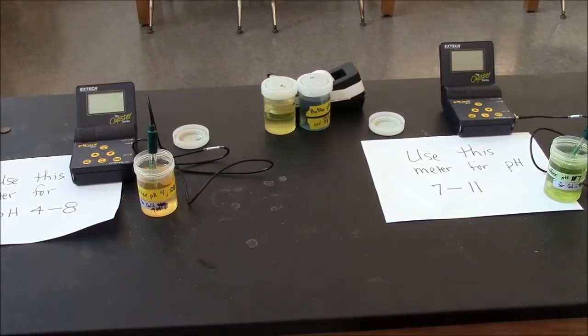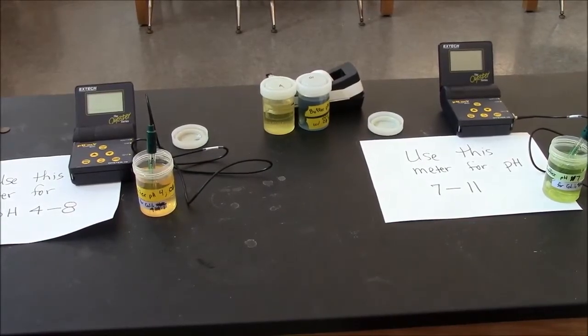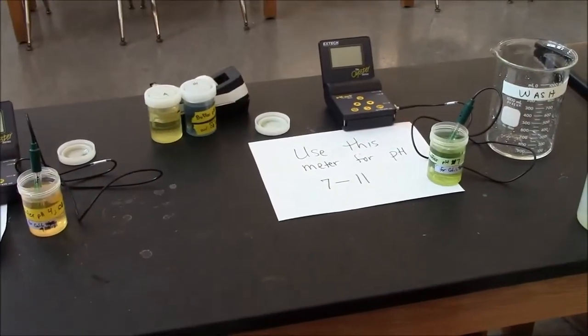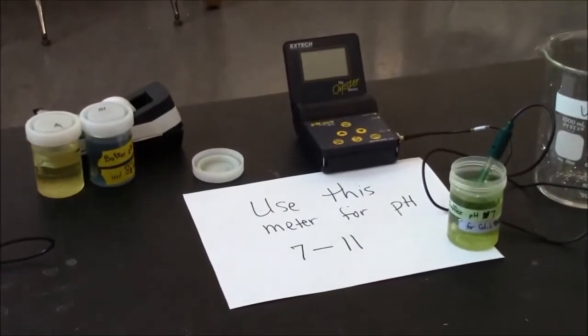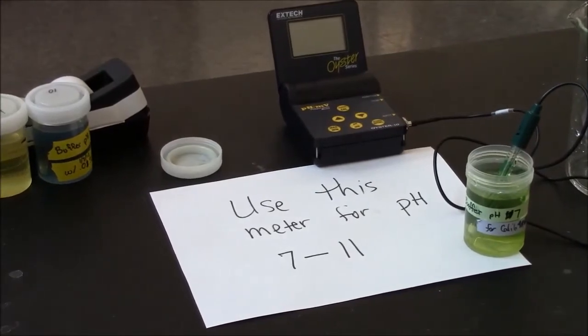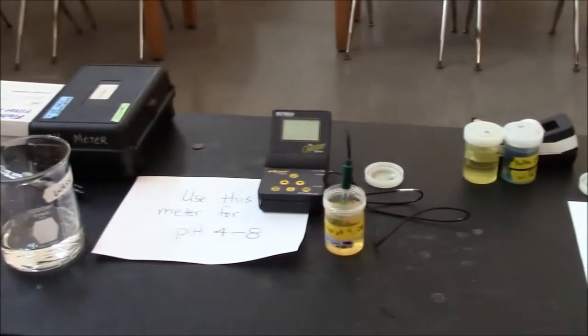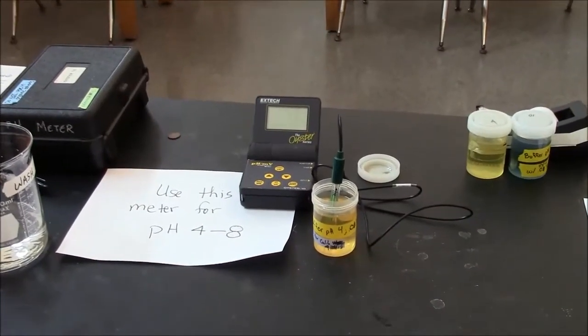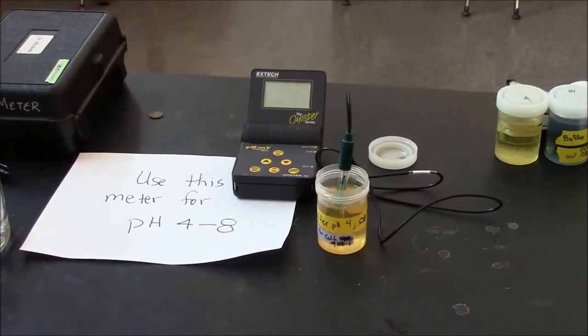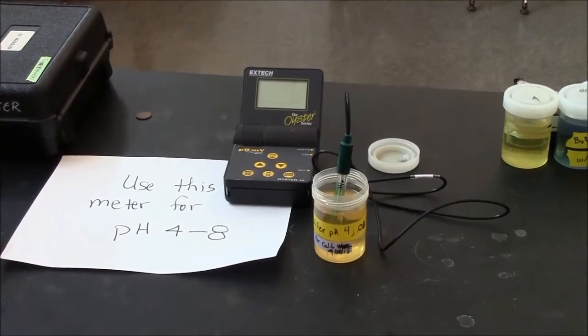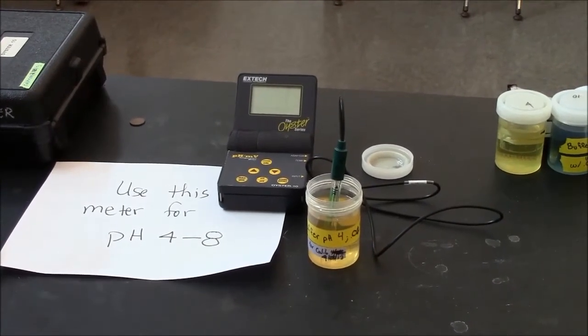There are two pH meters set up for your use. The one on the right is set up to measure between pH 7 and 11. It's calibrated for that pH range. The one on the left is calibrated for the lower pH range of 4 to 8. So try to use the correct meter based on the pH of your buffer.